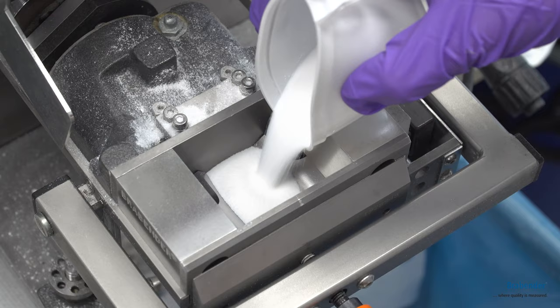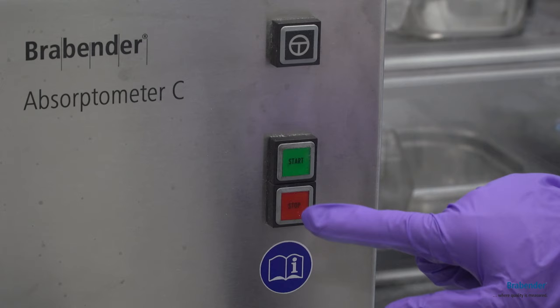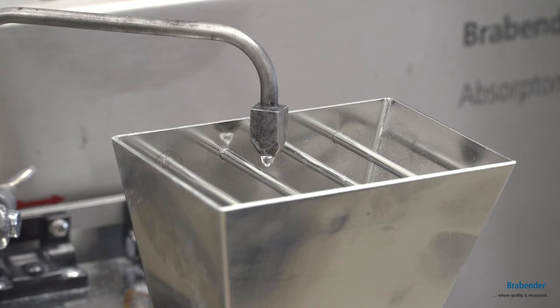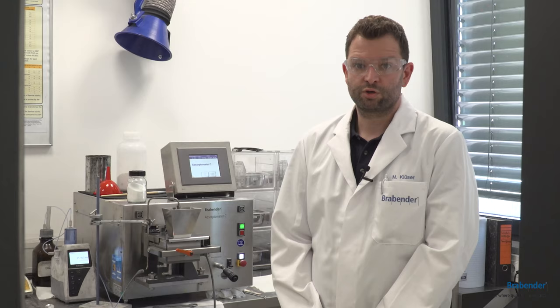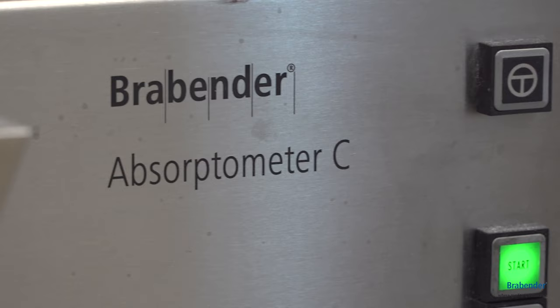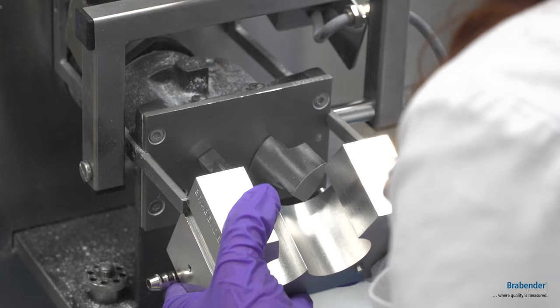The measuring principle is based on the change of consistency of the powder during the absorption of oil. Depending on which material is used, the oil absorption number can vary.